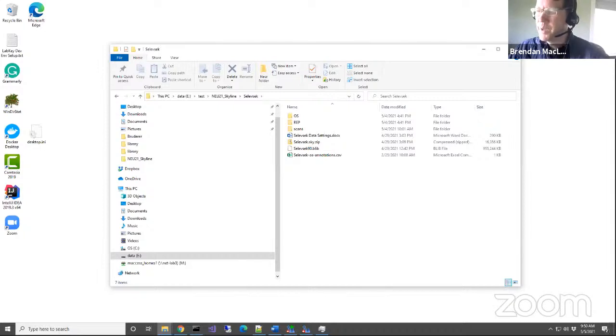That's pretty much describing exactly the experience I had with Bruker. They gave me a .d folder, and I eventually came back and said, this looks like really weird mass error. I'm getting really weird mass errors here. And they went, whoops, we just ran a calibration tool. Here's the .d folder again, and everything worked great.